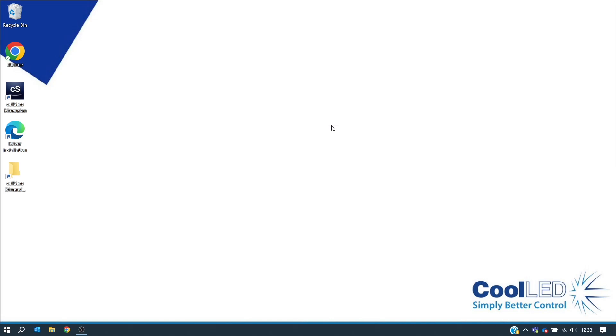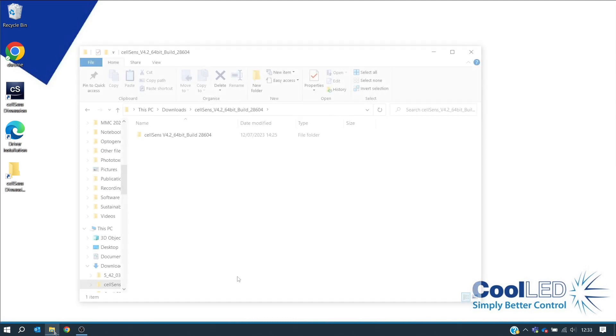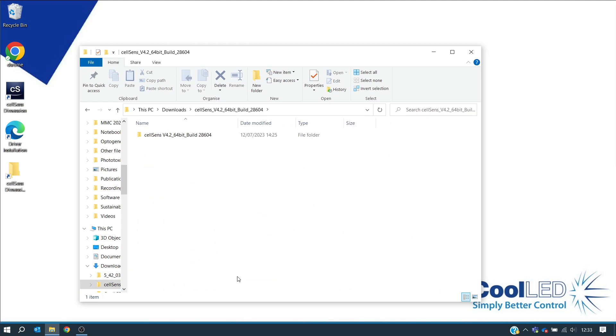The next step is either to download CellSense following the instructions from the Olympus website or to modify the installation to add your Cool-LED illumination system. As you can see here, we have already downloaded a version of CellSense, so we need to modify the files. To do this, you must locate the original installation files.